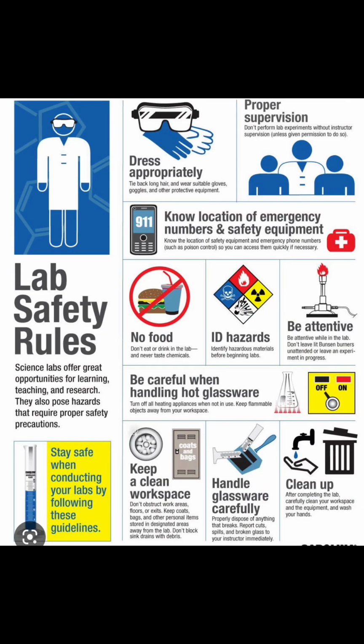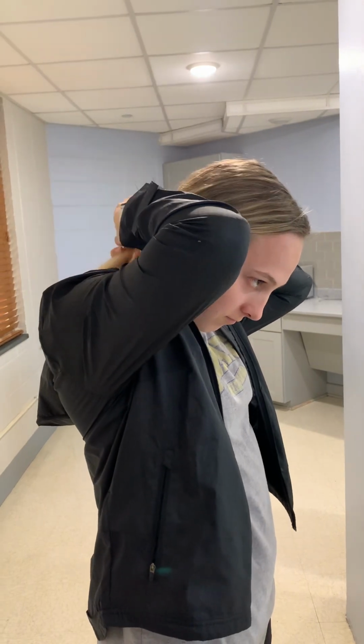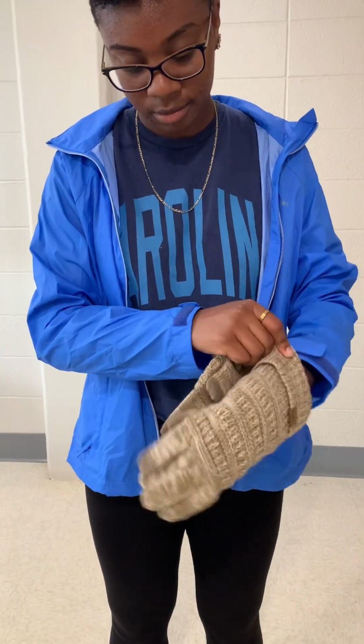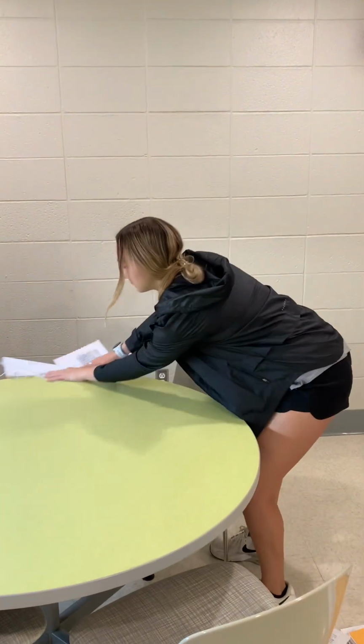Before lab, make sure you follow all safety precautions. This includes keeping your goggles on. The goggles reduce the transmission of UV radiation that is produced by various light sources. Make sure any loose hair, clothing, or jewelry is pulled back. Wear gloves at all times when handling chemicals. Clear the space to be free of lab notebooks, laptops, or cords.